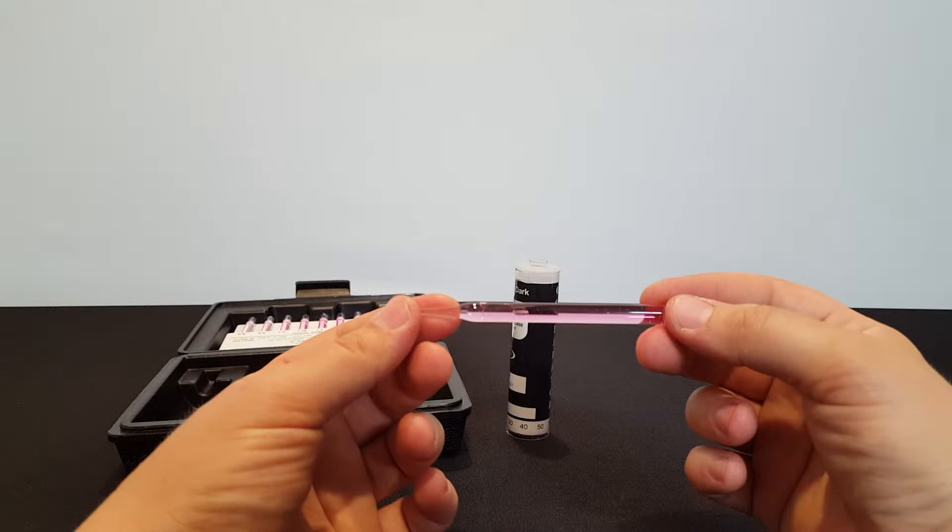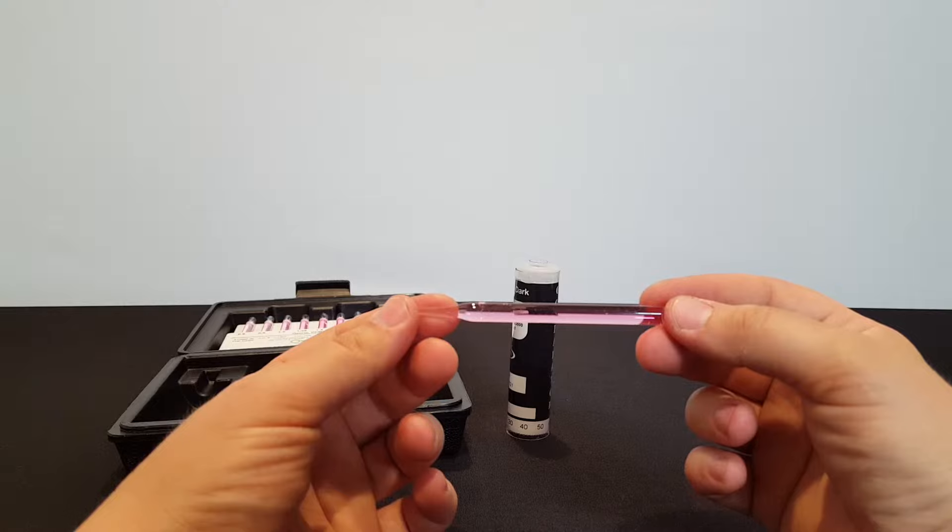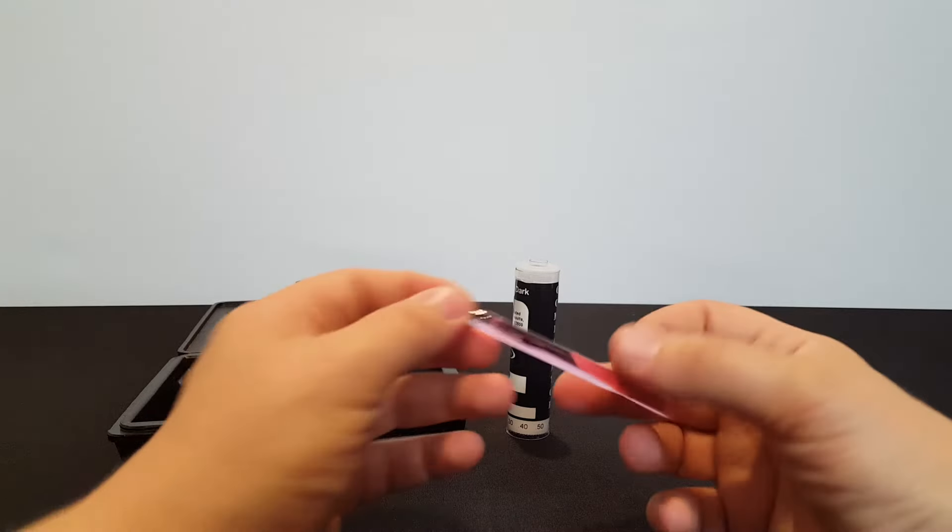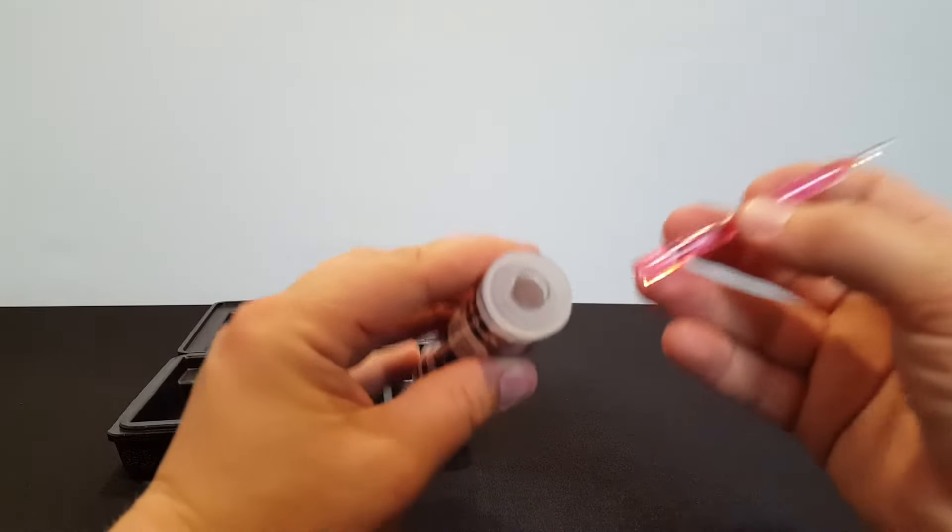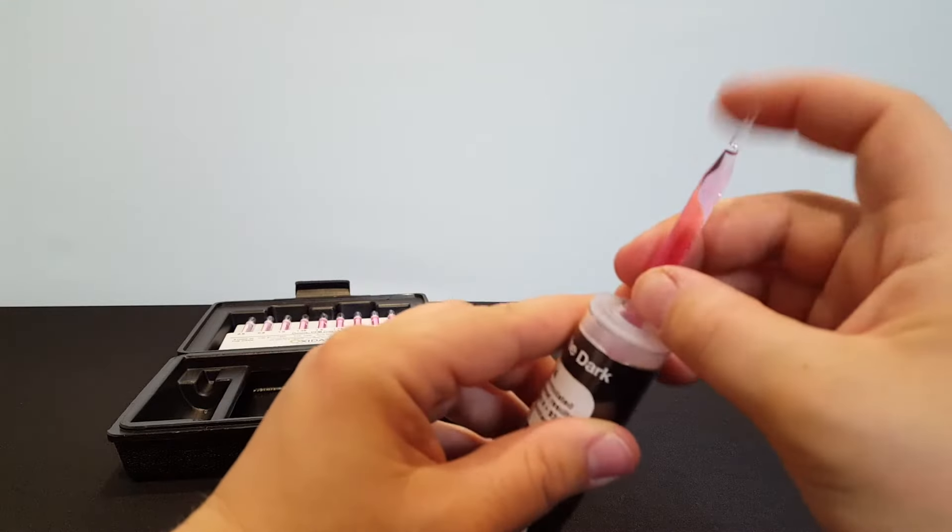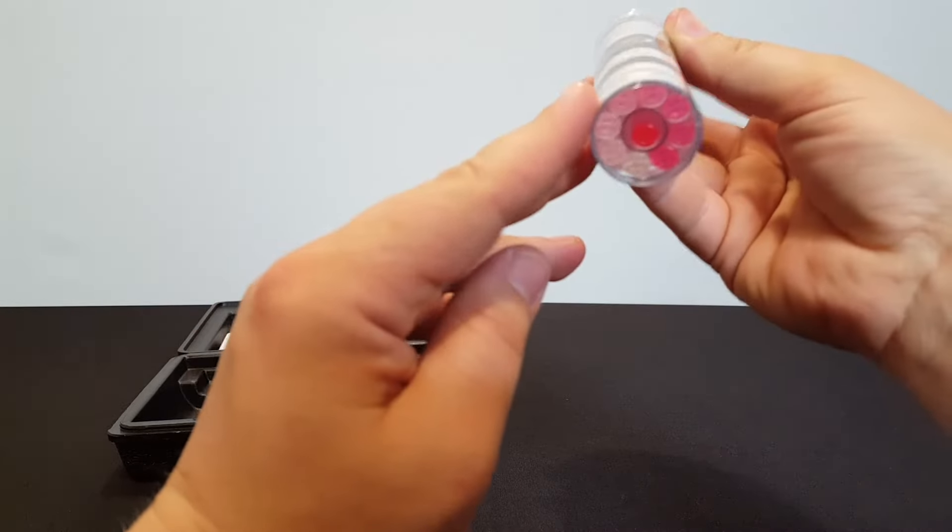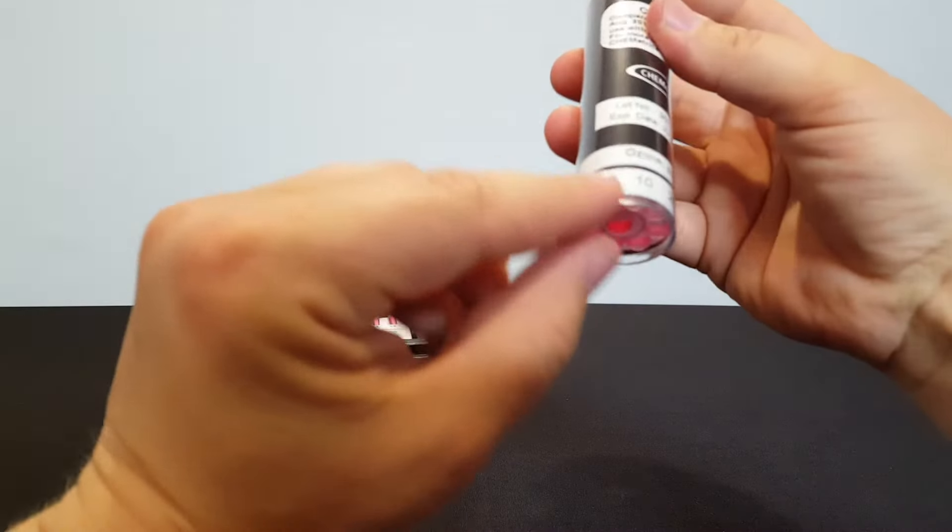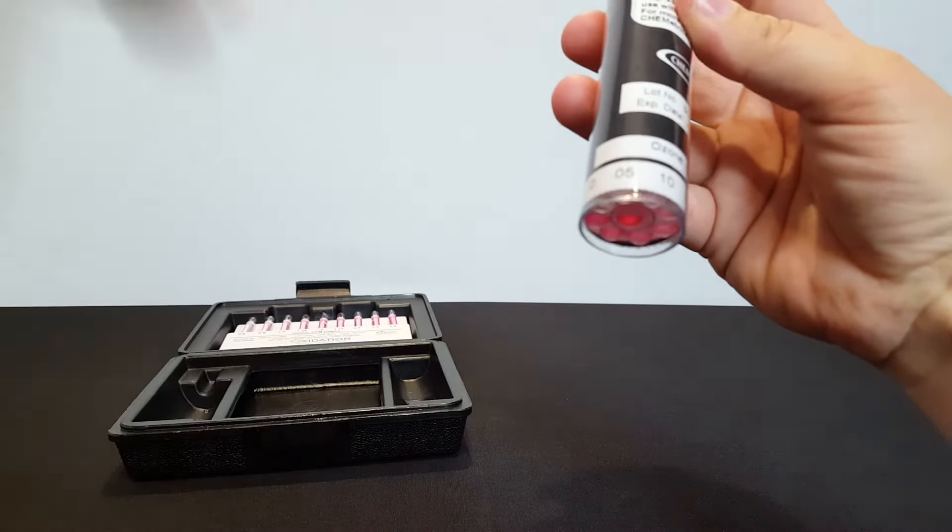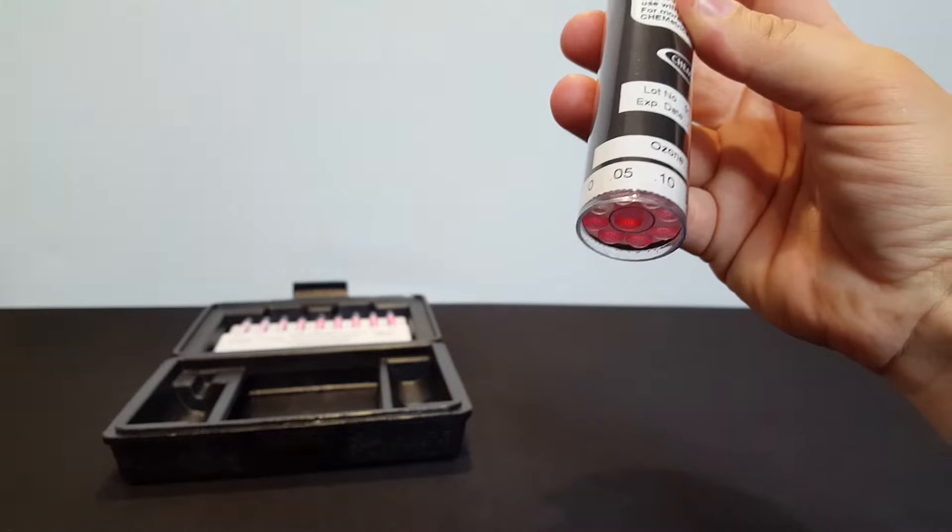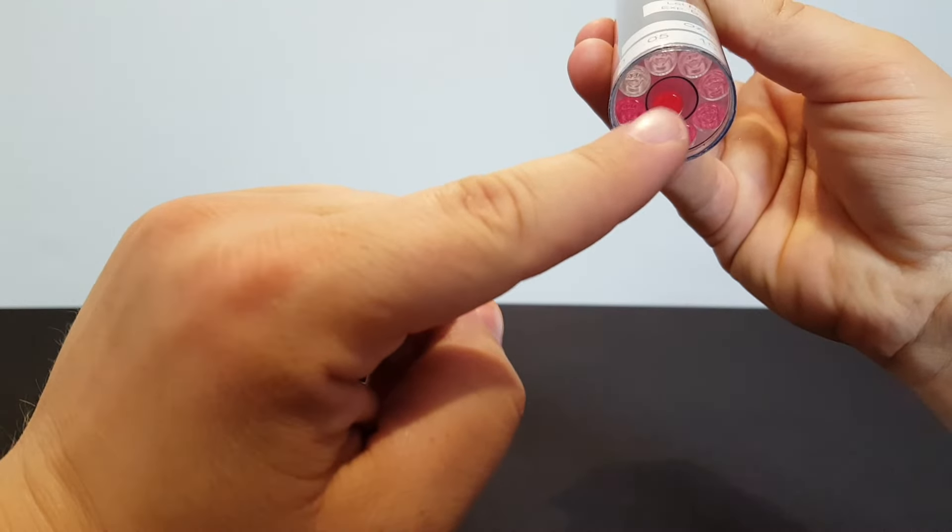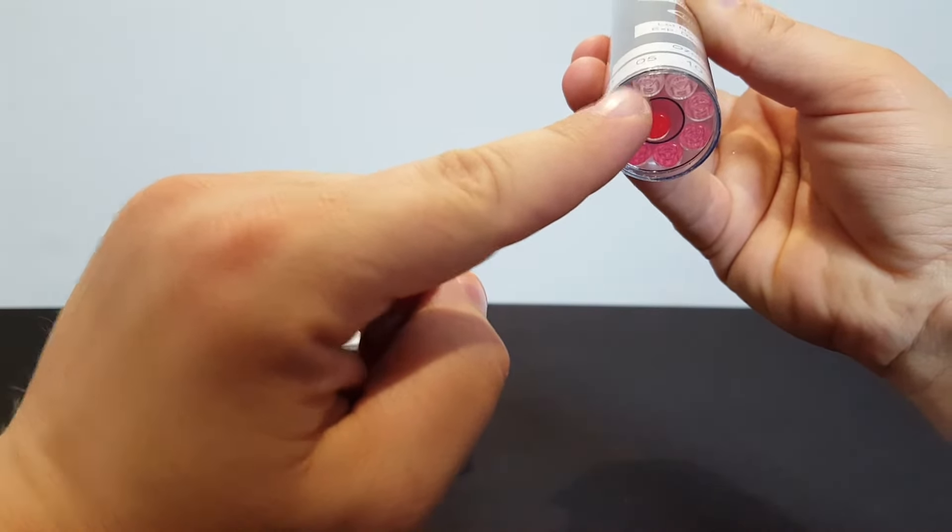Now that a minute has passed, it's time to compare the test vial to the comparator. Since we're dealing with a fairly light pink color here, we're going to go ahead and slide it in the lower level comparator, which goes up to 0.6 parts per million. It's obviously much darker than the 0.05 parts per million, which is a very light pink. You can see that ours in the middle there is much darker.